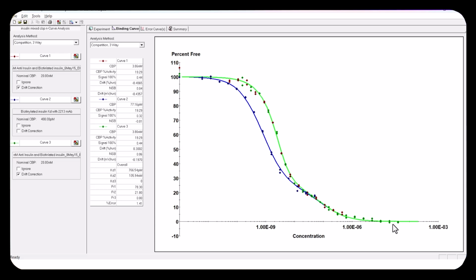So my hypothesis here is that there's a part of the population of the antibody that is recognizing the linker to the biotin with a different KD. And so it looks like we have two populations of binders here. But I wouldn't go to print on that. I'd want more data, supporting data, maybe mass-based data. I'd want something to tie this down in an orthogonal method before I put this out as a publication.